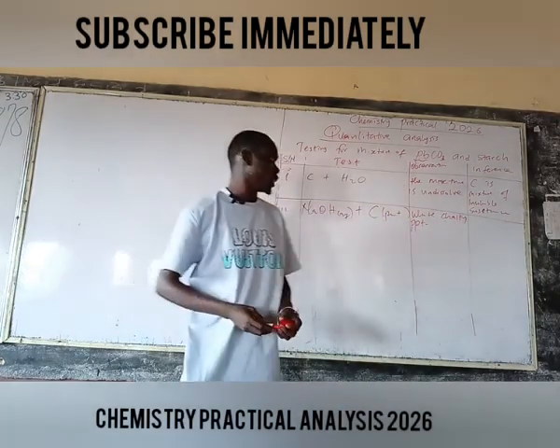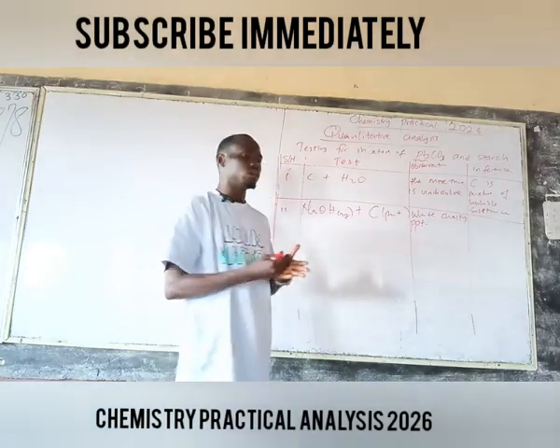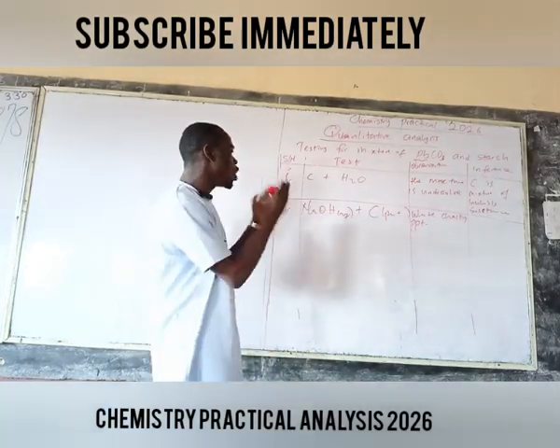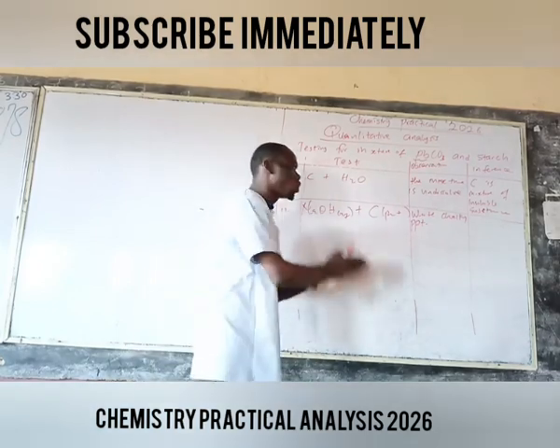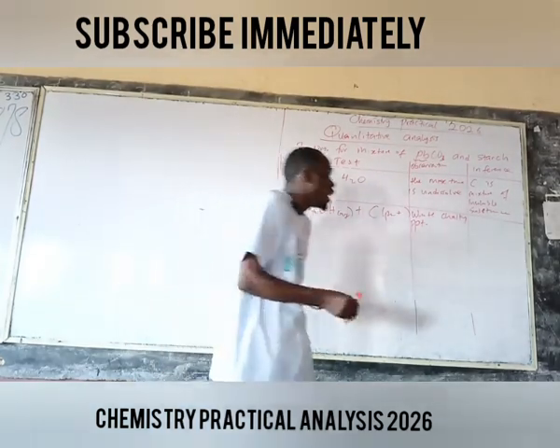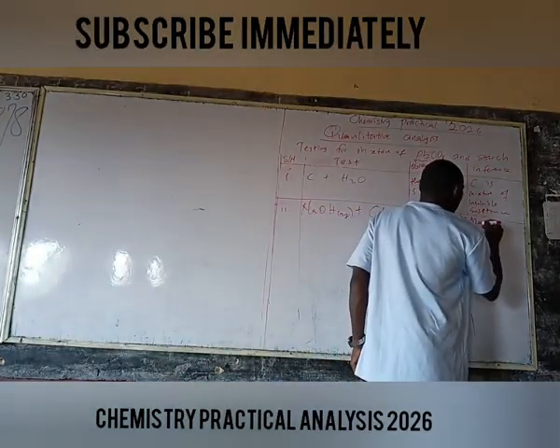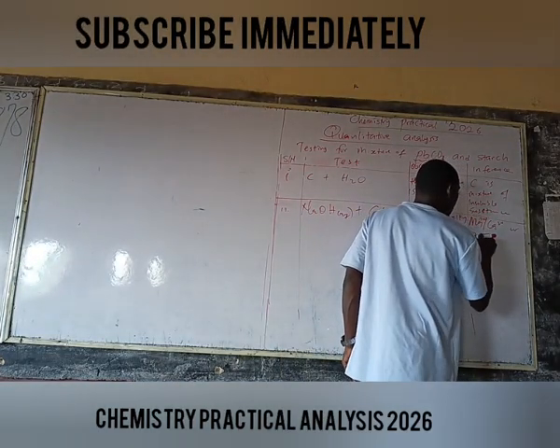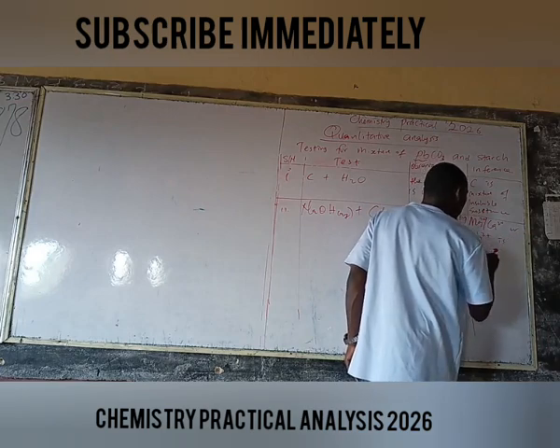Whenever we have a white chalky precipitate in the reaction of sodium hydroxide with a salt, what can we infer? We can infer that magnesium, calcium 2 plus, or lead 2 plus is present.